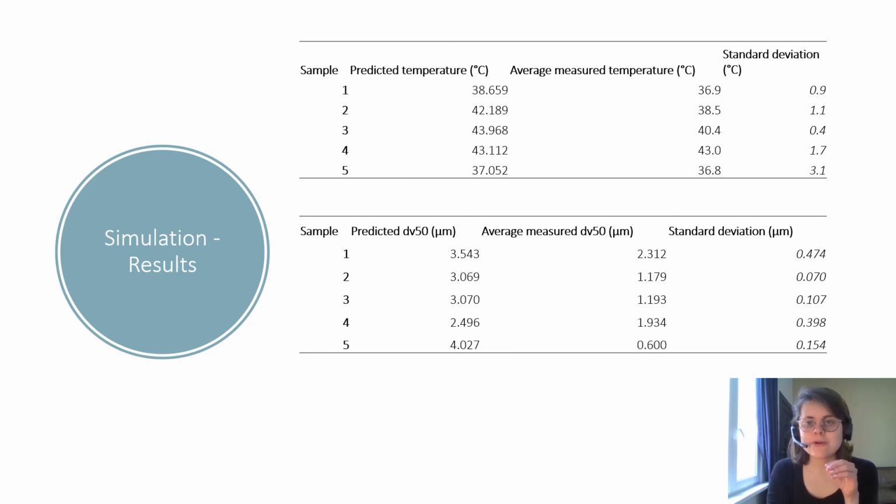We can already see that the simulated results are a bit higher than what we got in the laboratory. The variability of the measurements can be a reason, but still quite interesting that we can get pretty close to what we predicted, and it can already be a rule of thumb of what we're going to do in the laboratory, and therefore reducing our laboratory work.